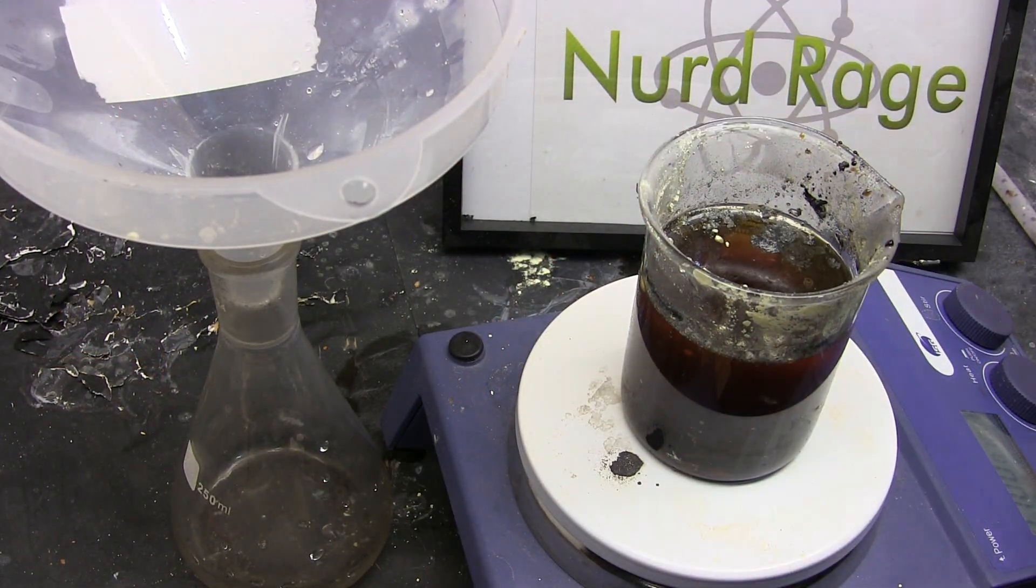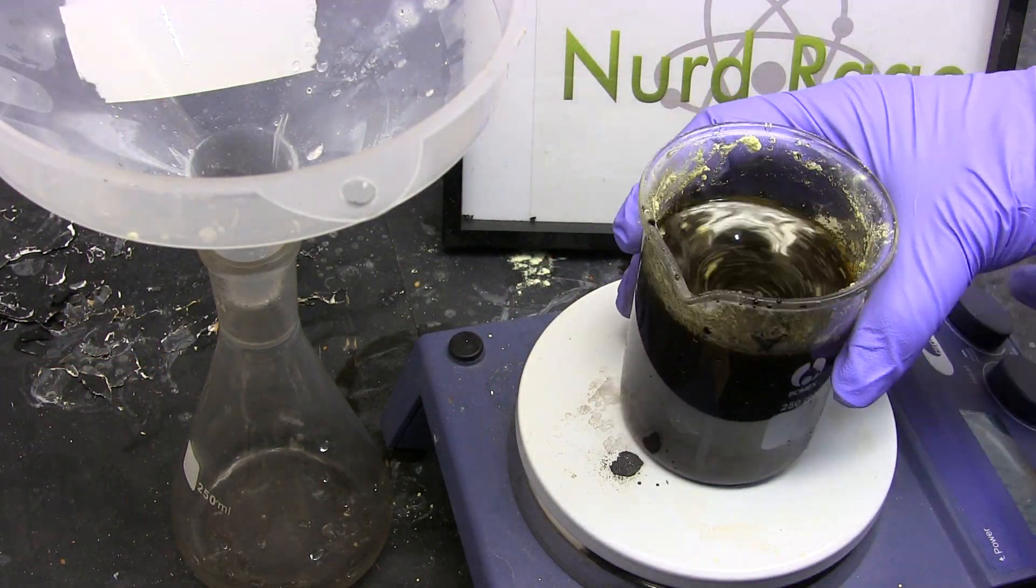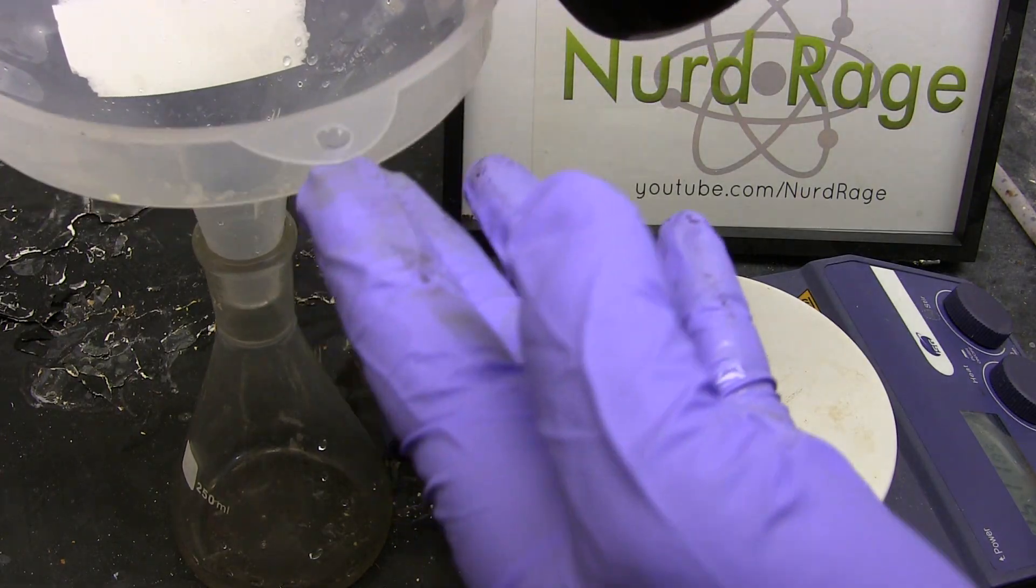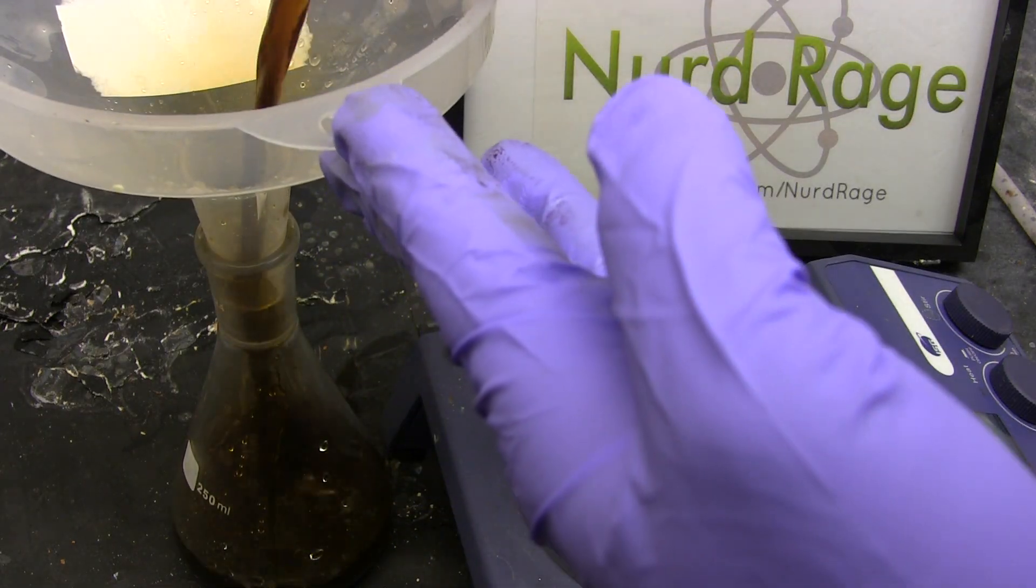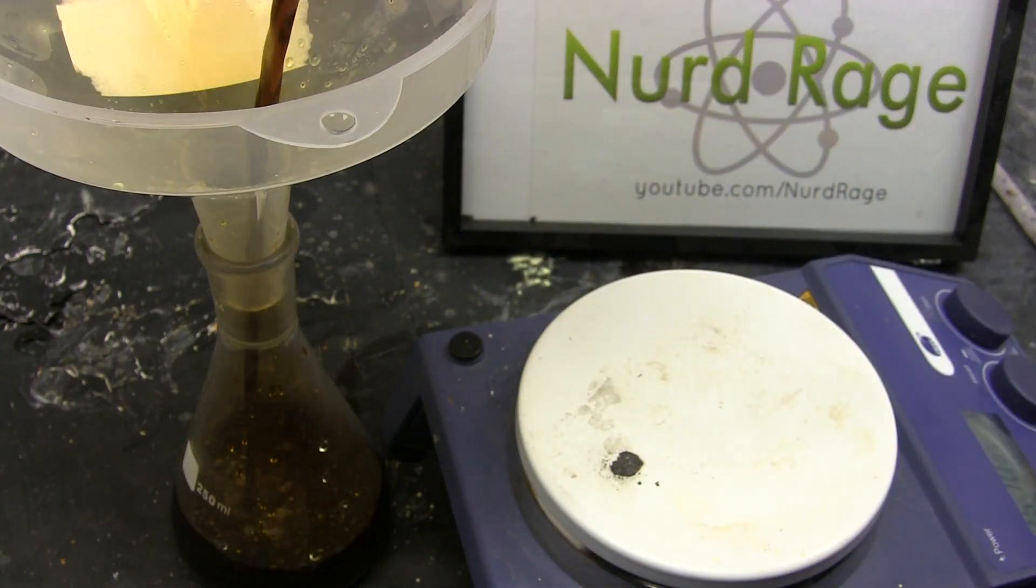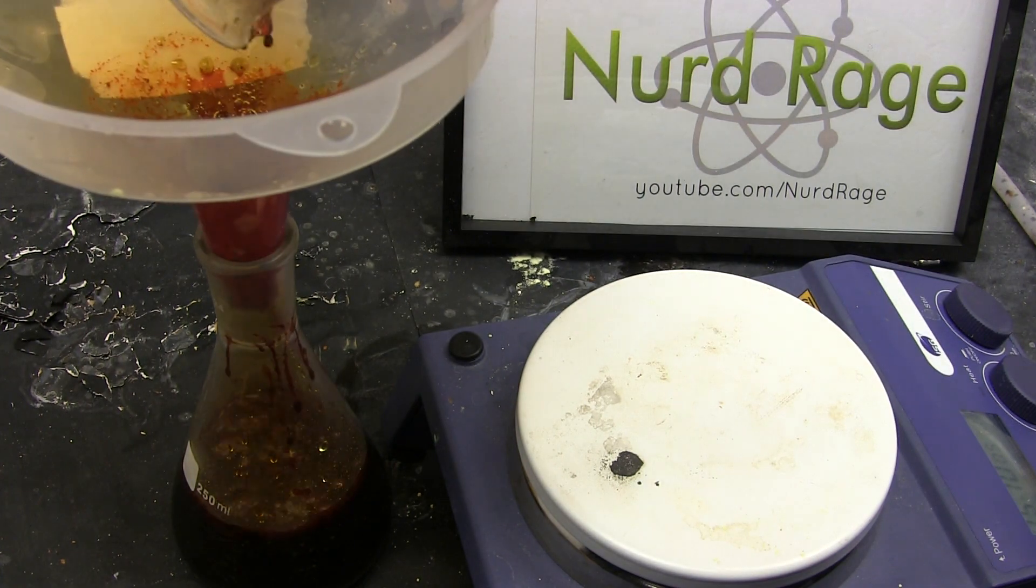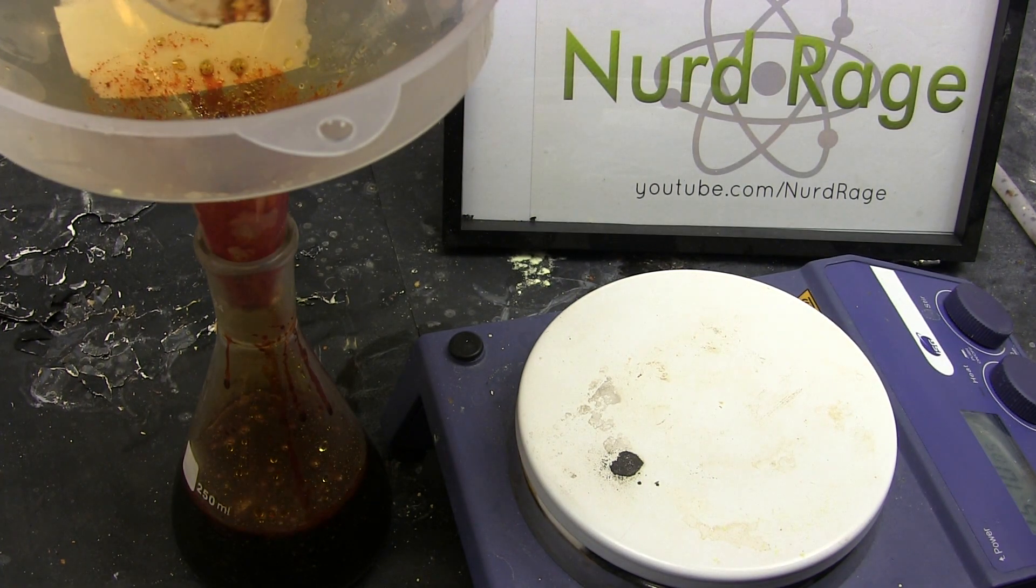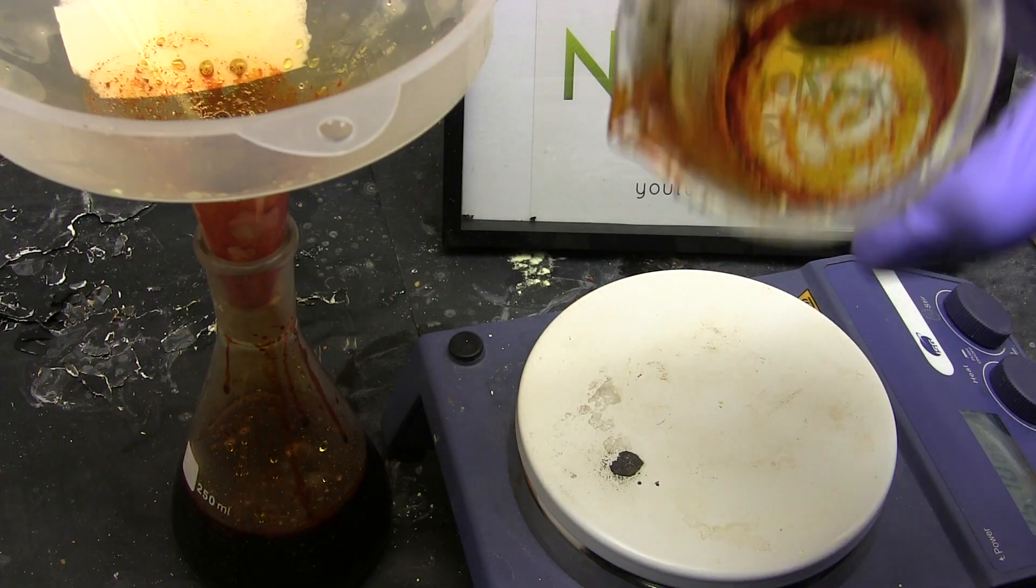Now the electrodes are removed and after a brief stir to mix everything up the mixture is transferred to an Erlenmeyer flask. I must emphasize again that you do this outside or in a fume hood as you can see bromine vapor coming off the mixture. Also sulfur bromides have their own unique stench that you don't want to sample.